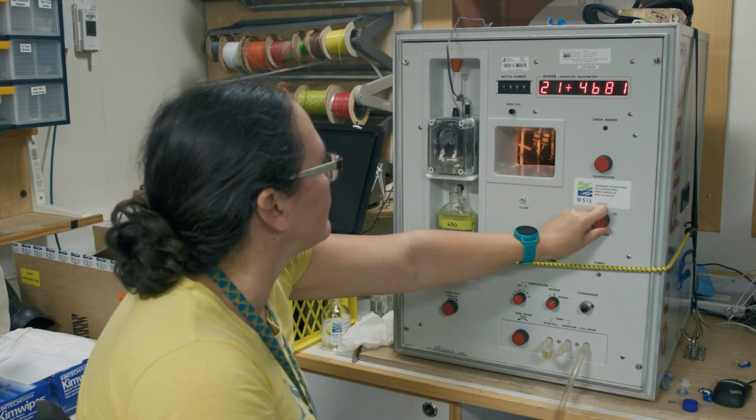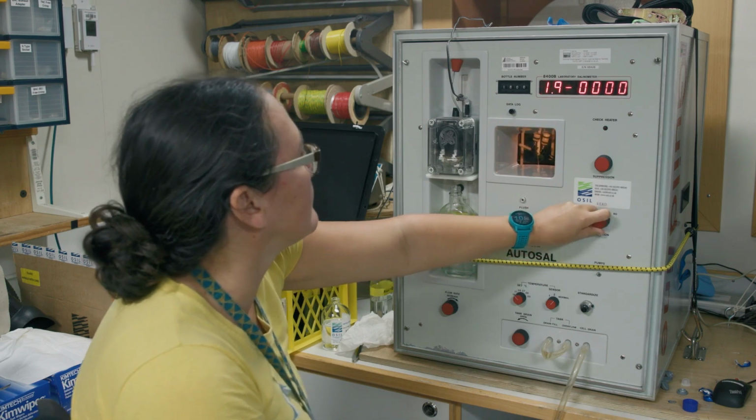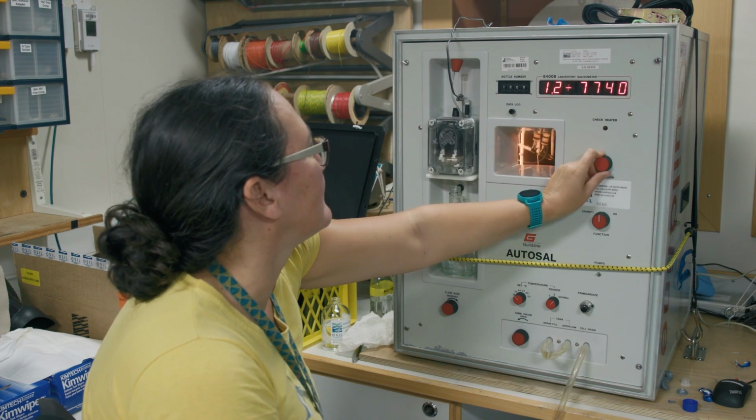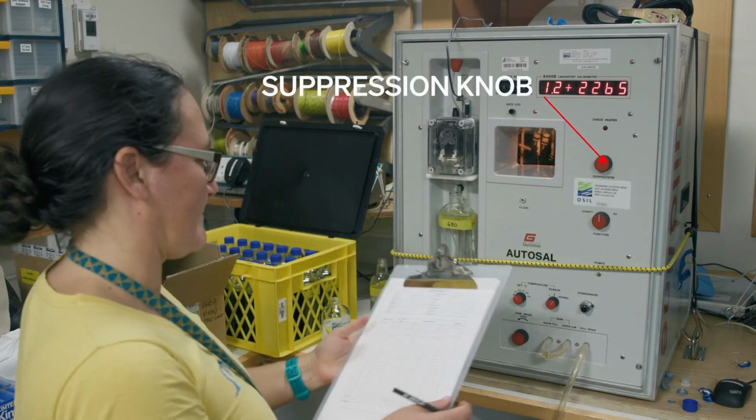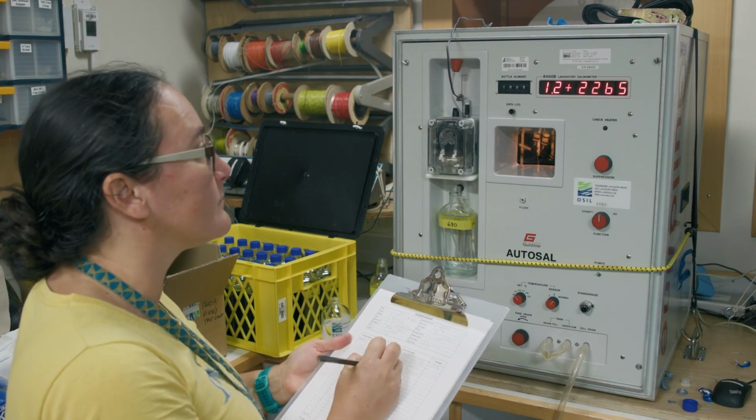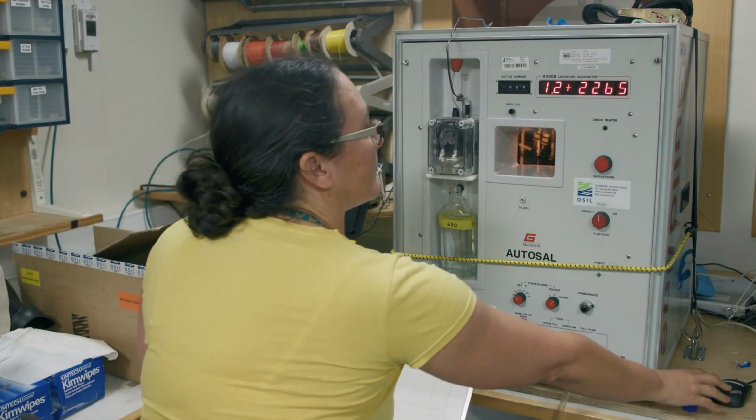Here the display is flashing and has a minus sign in the middle because the sample we've just started measuring is much fresher than the standard seawater. We therefore turn the suppression knob down until the display stops flashing and shows a plus sign. Now we can let the value stabilize and record it.